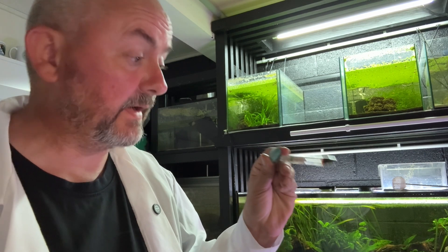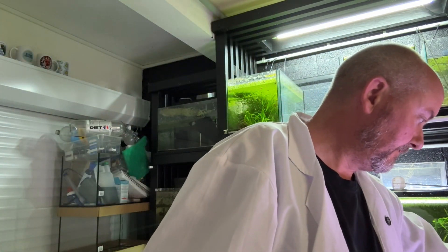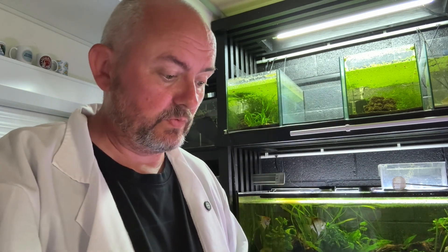We'll do it again, this time with one of these standard thermometers. Surprised it's that low, considering today it's 26 degrees outside, ambient temperature. But we'll let that settle in the water for a bit, get the correct temperature, and go off that against the probe. But I am very impressed so far with the pH and everything.